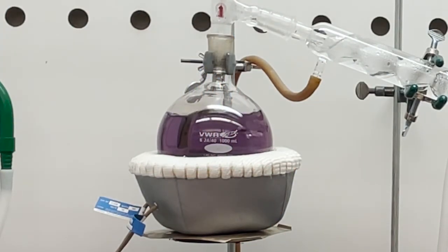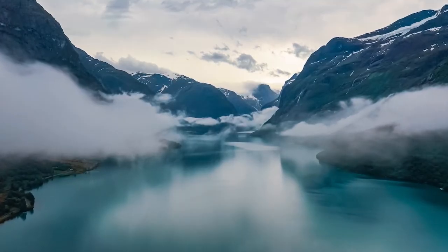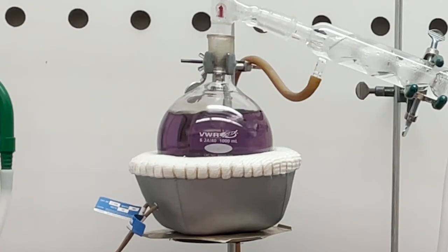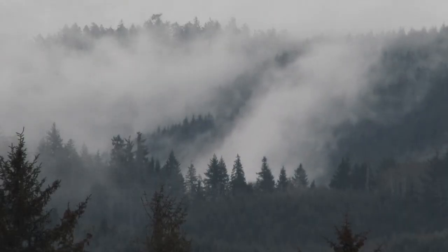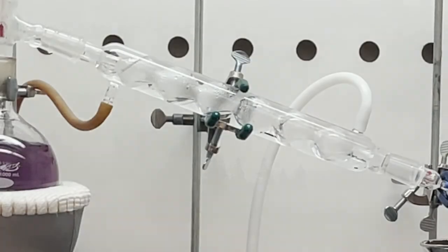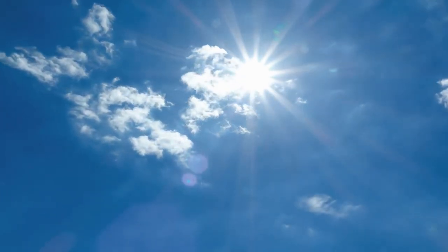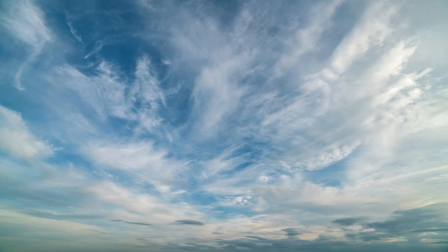Imagine that this flask here is a source of water, like the ocean, a lake, or even trees. Here we're able to observe high energy being applied to the water, causing the water molecules to move rapidly. As the water heats up past its boiling point, it becomes steam, which is able to travel upwards as an air parcel. The following steps of the hydrological cycle are done in this interesting horizontal piece of glassware called the condensation column, which is used to simulate clouds as the moisture interacts with the wall of the column.